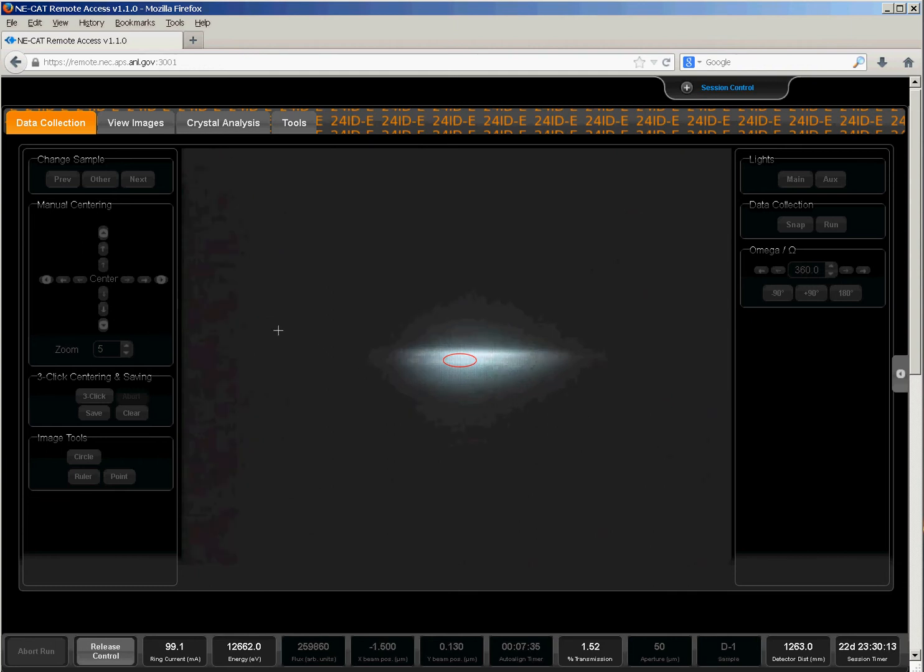During the auto alignment, all of the controls for centering and sample selection should be grayed out, and after auto alignment is completed, control will be returned to the user. The first thing when auto alignment completes, you'll notice the X-ray beam is no longer visible, and then eventually you'll see your sample move back if it's mounted. Once the controls are returned to active, you're ready to proceed. You should also get a message that auto alignment is complete.